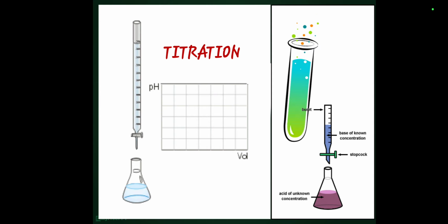Okay, so this is the last topic, or the last lesson, that we will be discussing in finals, and it is entitled titration. It is very different from the past topics that I've already discussed with you, because those were focused on calculation, while titration is basically focused on the application, meaning it is more on the experimentation. There is a procedure and a step-by-step process.